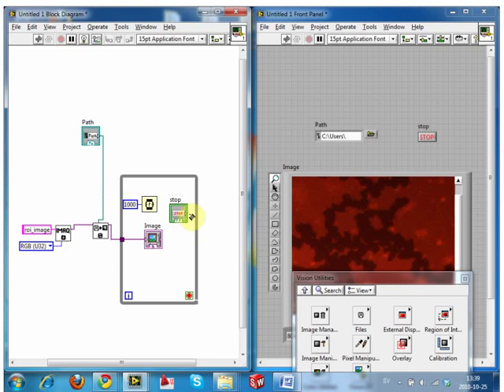And if you try to keep with some of the good practices like this, because even at 30 frames per second, I've got enough time to hit the stop button. I can hit the stop button faster than 30 frames per second. So even at this, I could hit stop and it will still read it. But if you don't have any delay there, it's going to get really problematic. Okay, so does everybody have a way of displaying files?